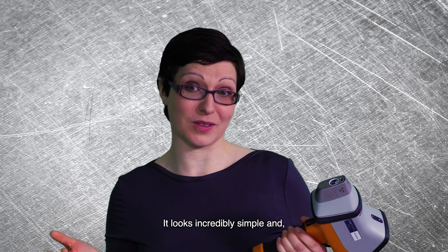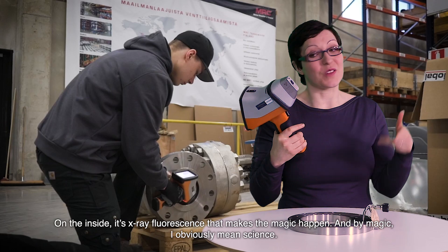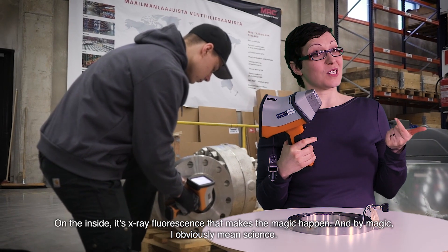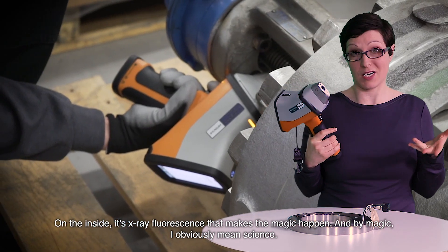It looks incredibly simple. And yeah, it is — on the outside anyway. On the inside, it's x-ray fluorescence that makes the magic happen. And by magic, I obviously mean science.